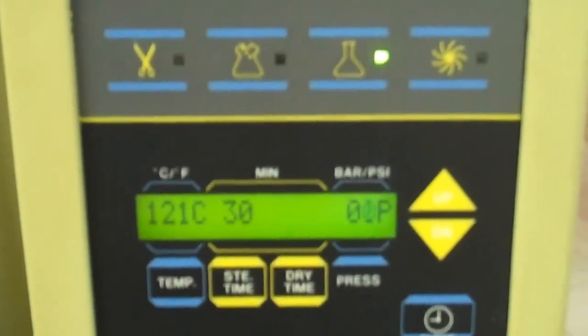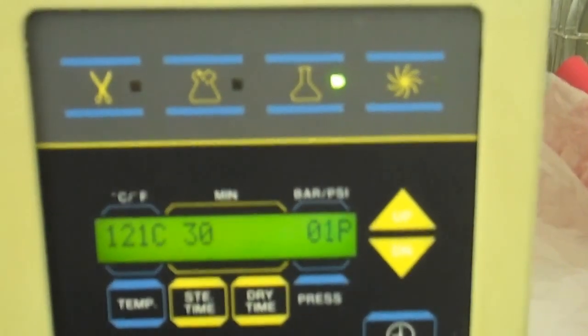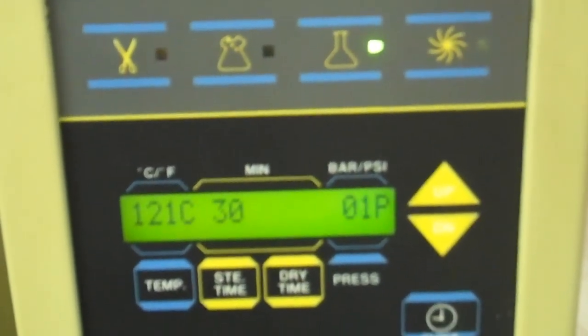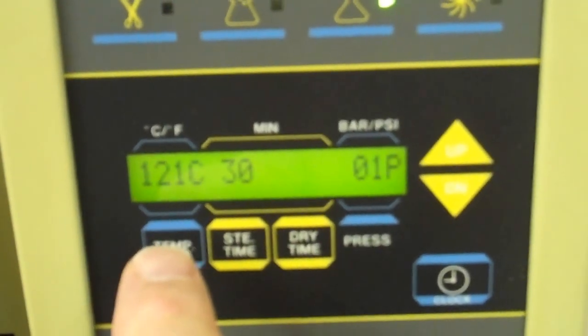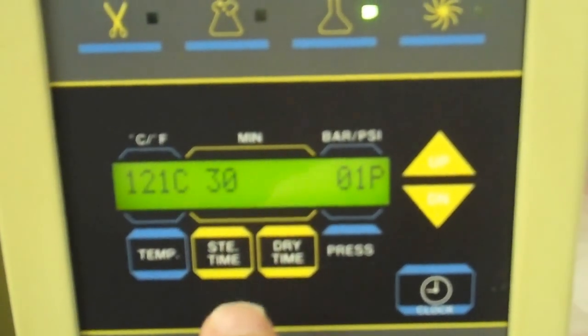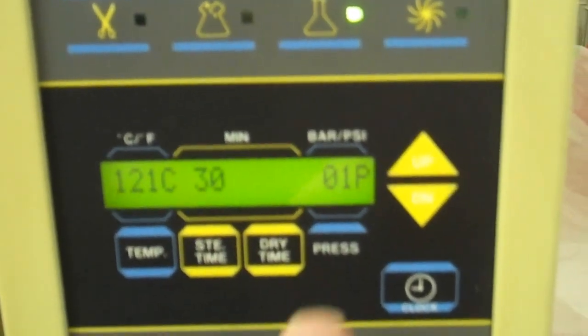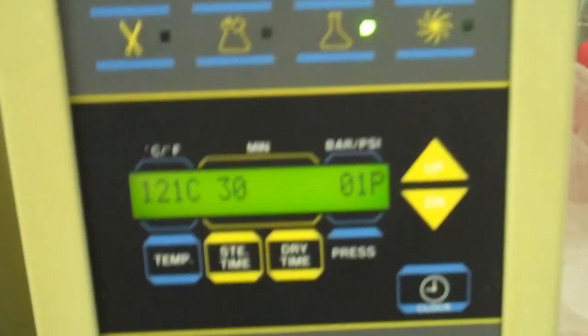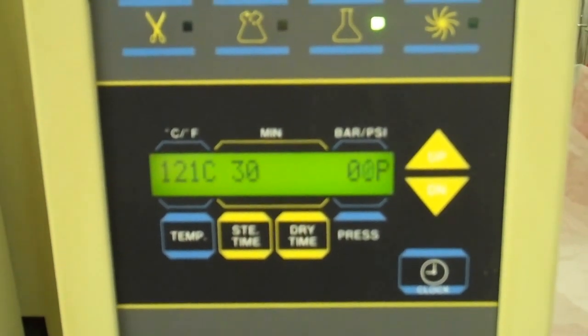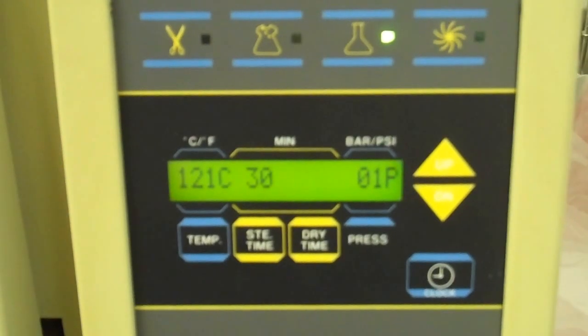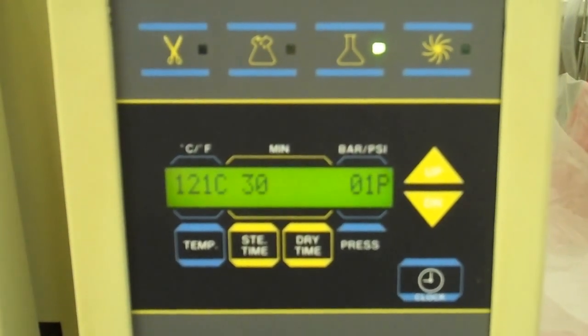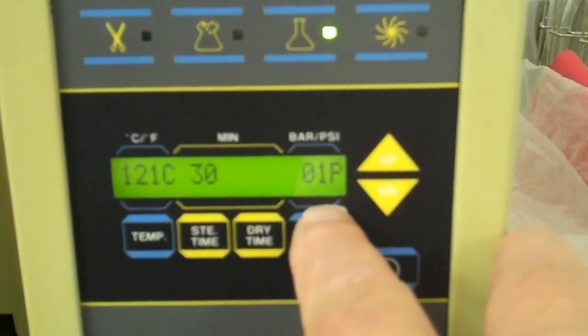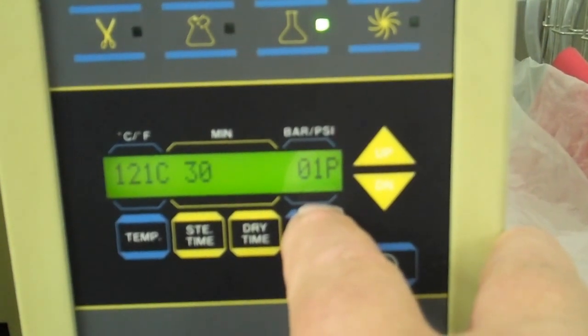The cycle panel shows that we're in the cycle for media. As you can see, the temperature is 121°C and the time is set for 30 minutes. On the right-hand side there's the pressure in the chamber. When you initiate a cycle, the first thing it'll do is pump water into the chamber, then it will heat up the water to 121°C. When it achieves that, you'll also see that the pressure goes up to about 16 pounds of pressure.